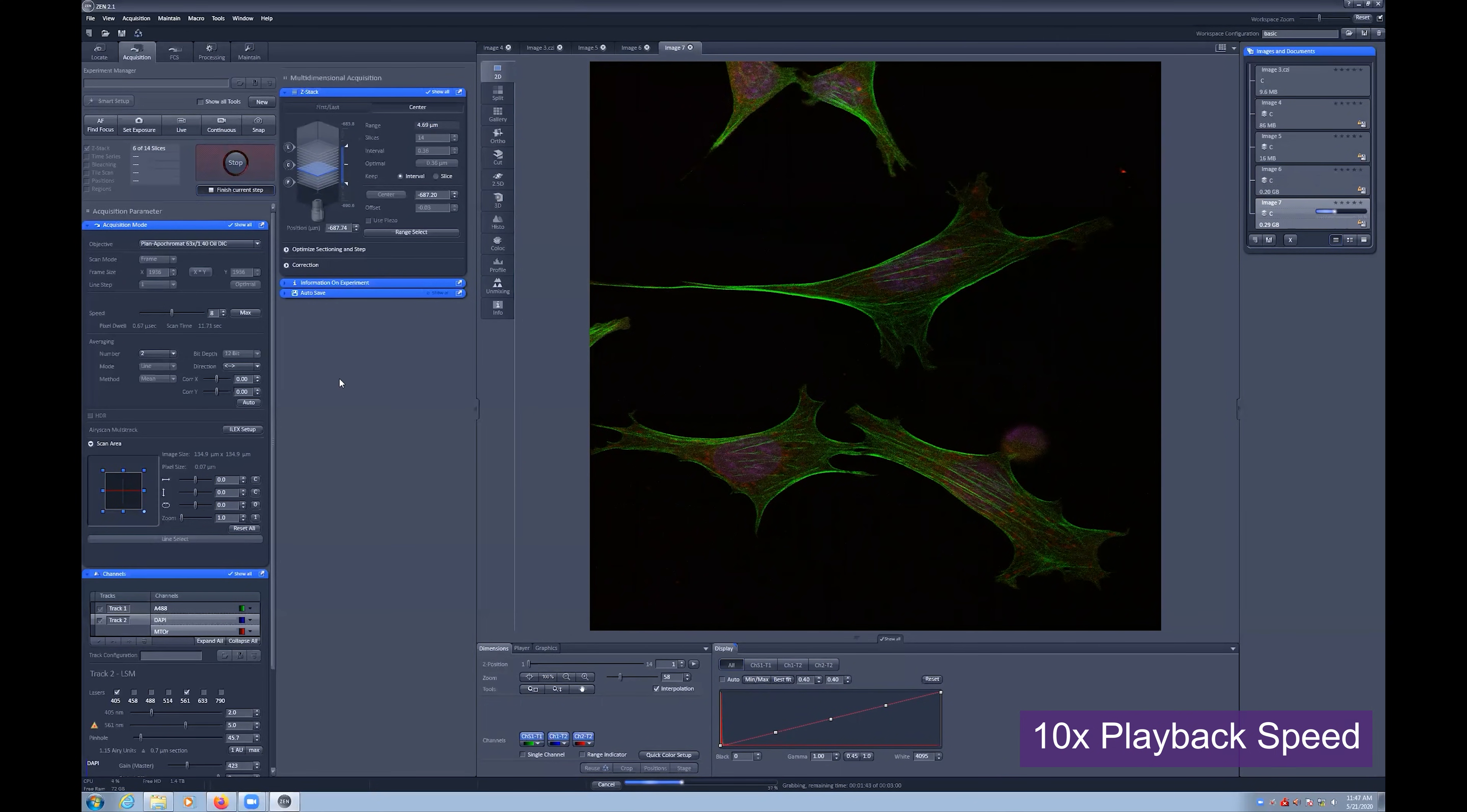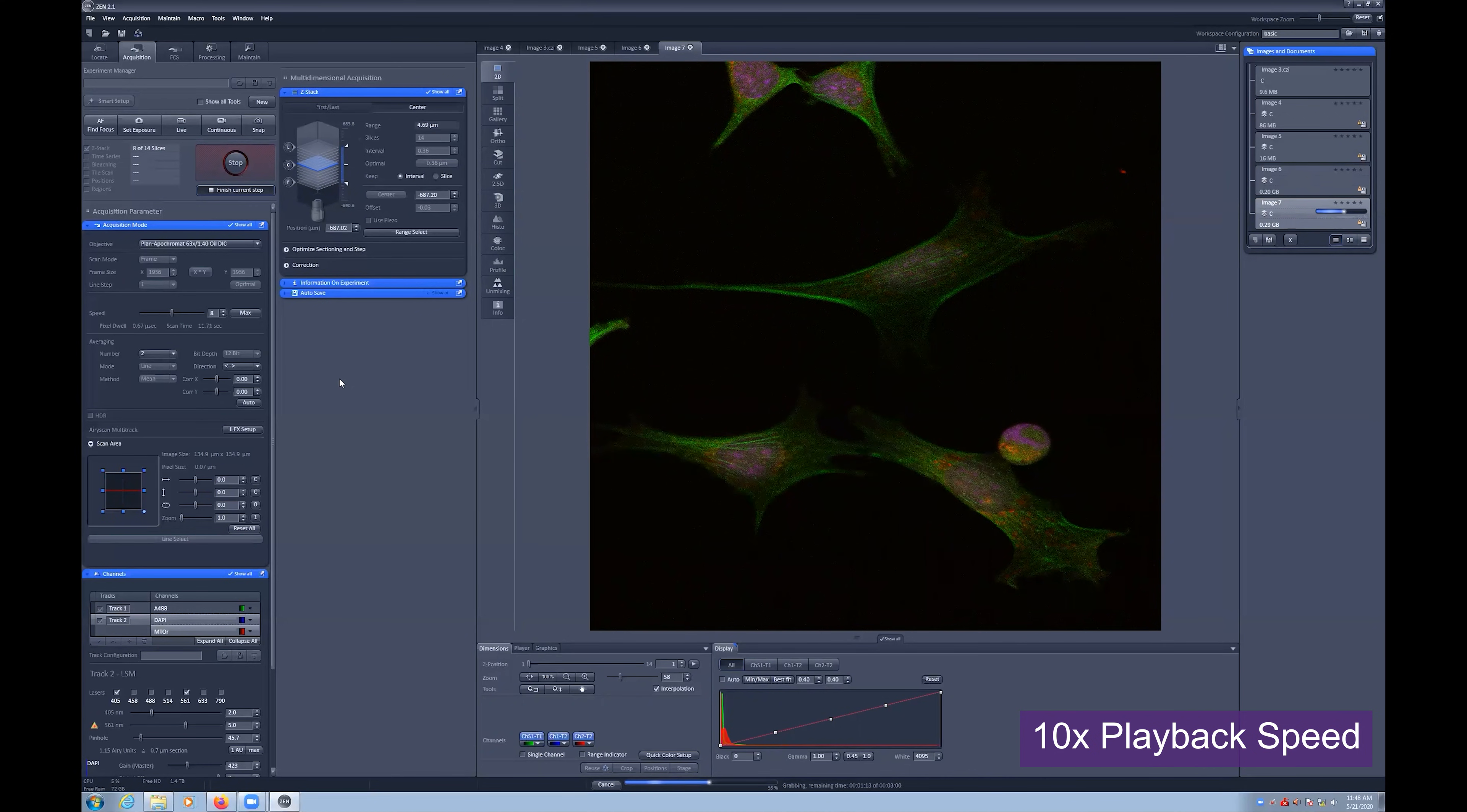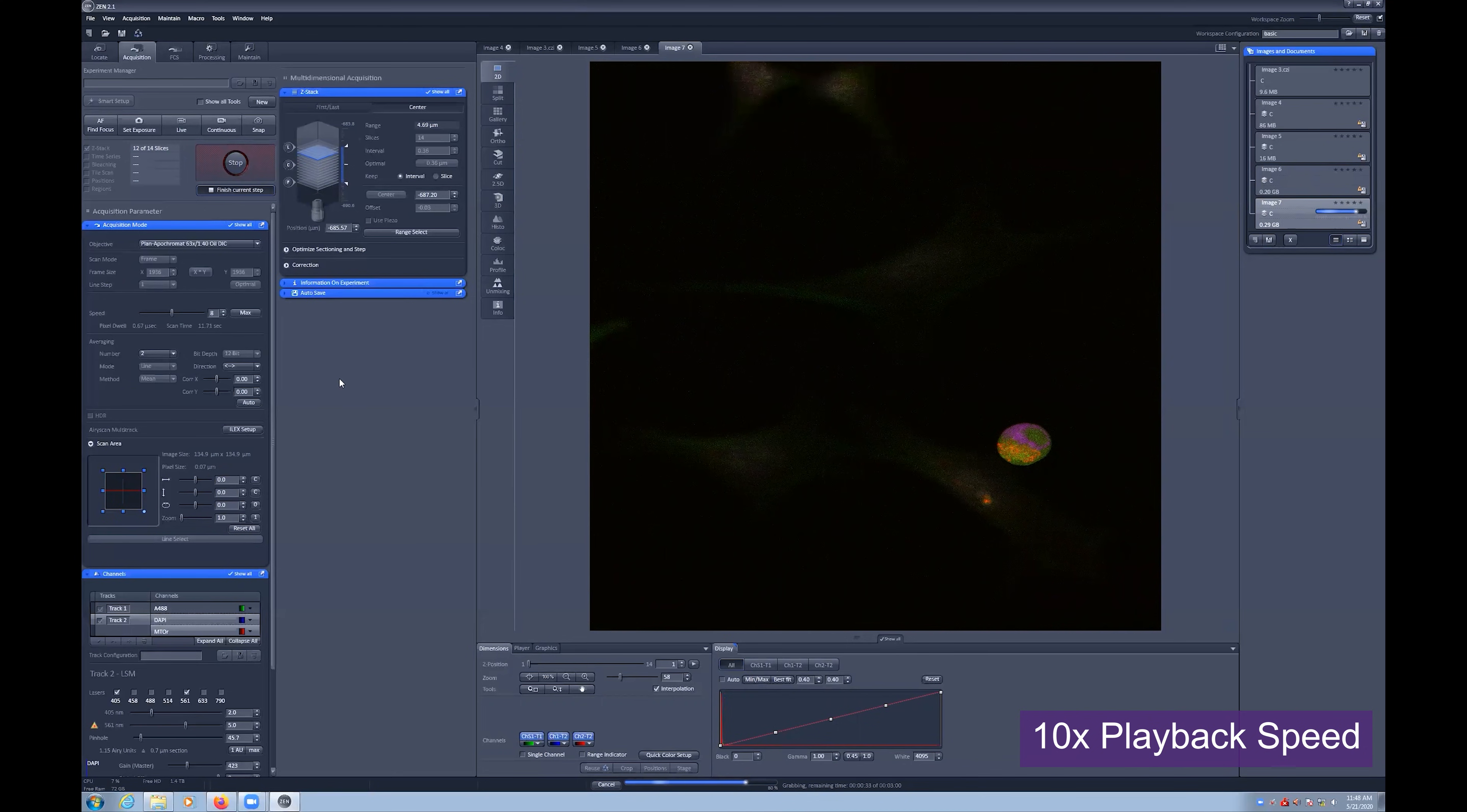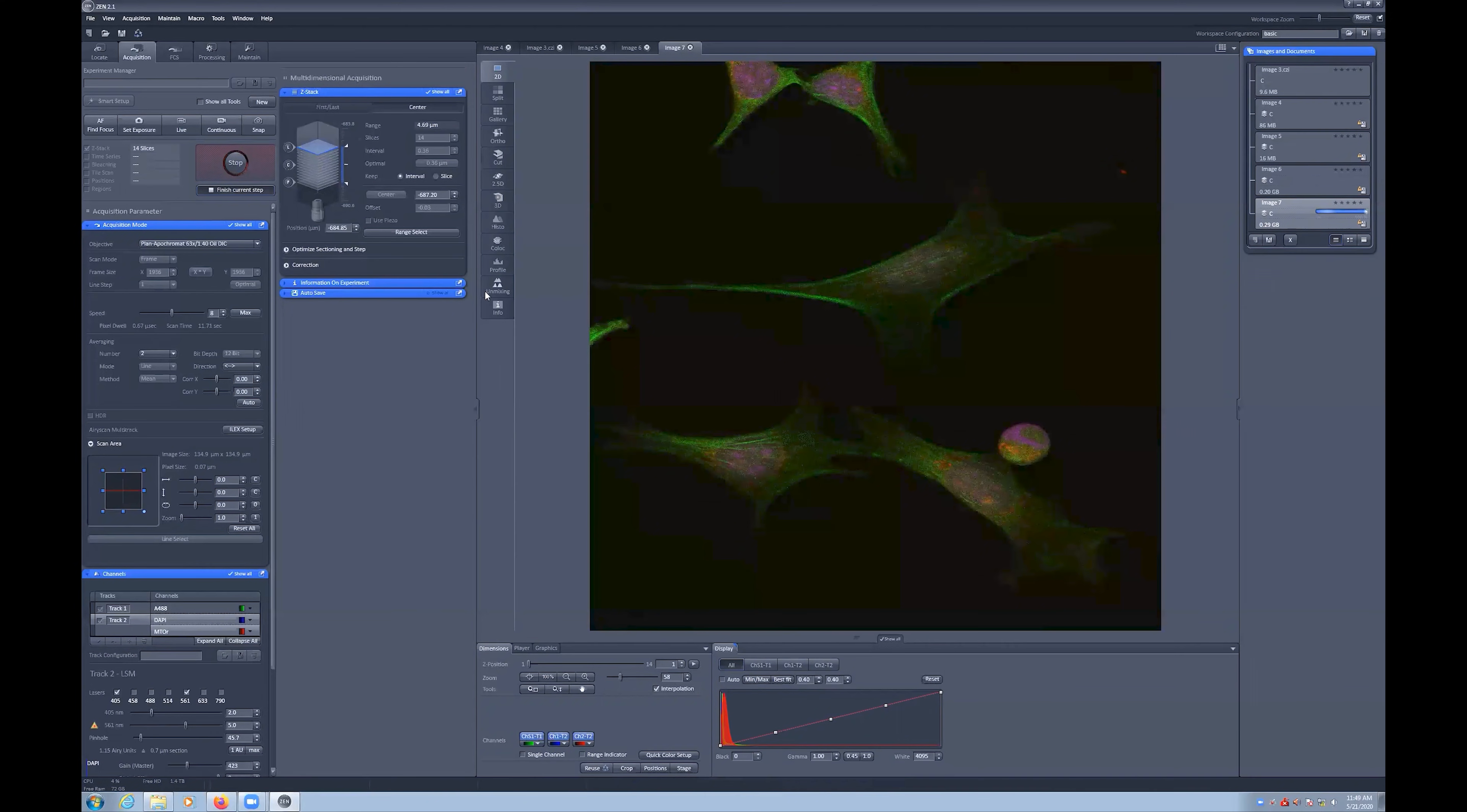For Center Mode, you do not have to use the Range Select tool. You can simply adjust focus until you are in the middle of your sample, select the center button, and define either the range or the number of slices.